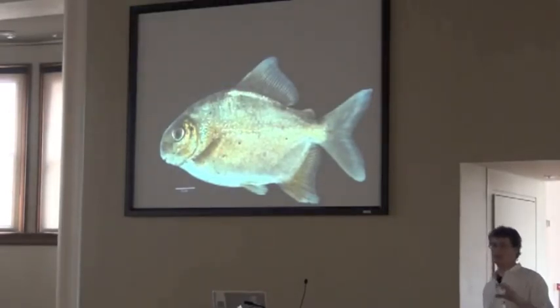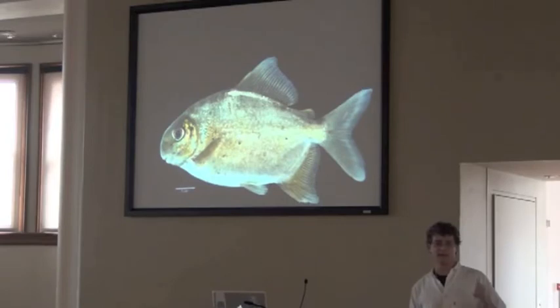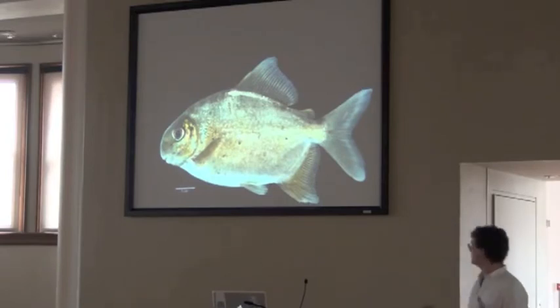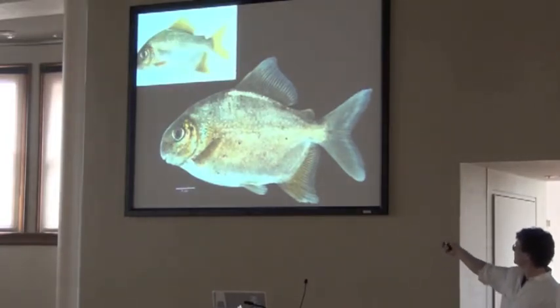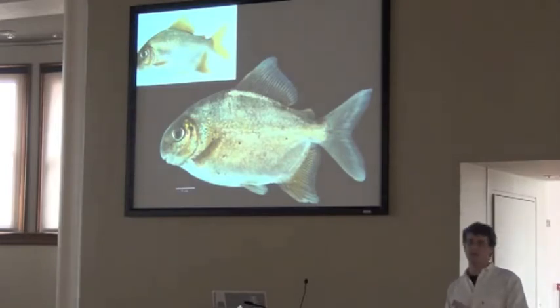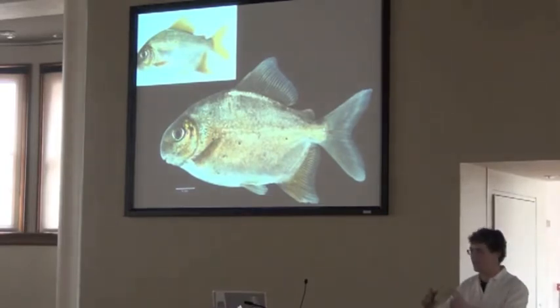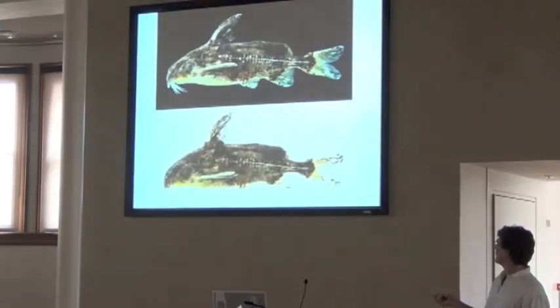Another thing about taking pictures of live fishes is that a lot of fishes have iridescences — blues, greens, turquoise — and those are lost almost immediately in formaldehyde. As soon as you put them in there, you can lose that completely. Here the top one is live and the bottom one is preserved, and I'm starting to lose the iridescence already. So you've got to be quick. You've got to have your setup ready to go, so as soon as that fish stops moving, you put it in your tank and get your photos really quick to preserve that coloration.